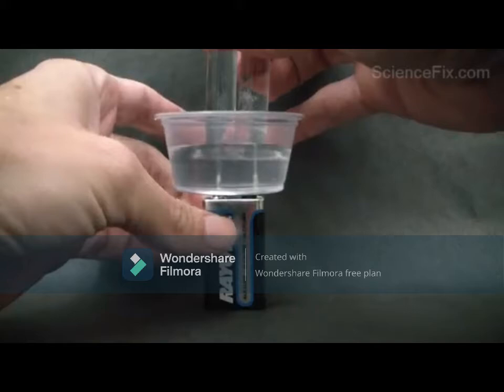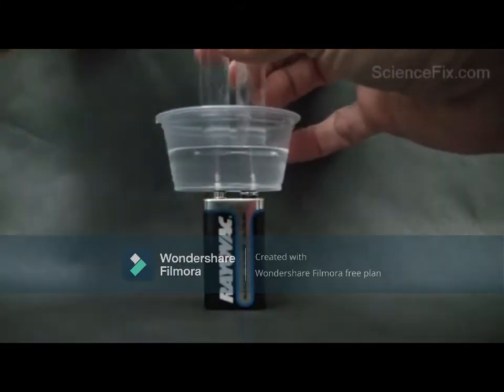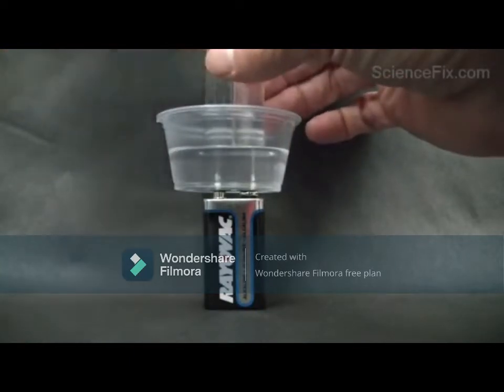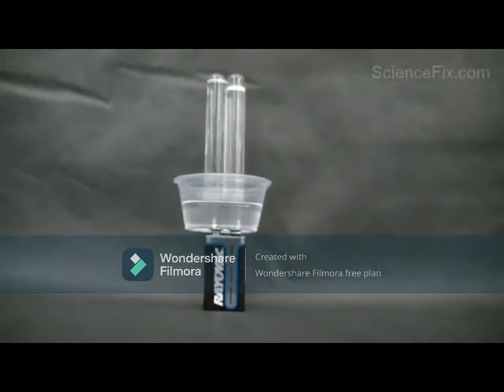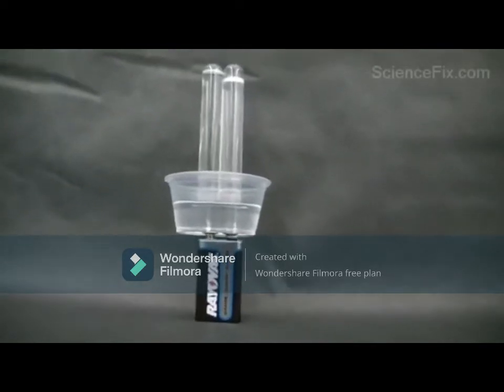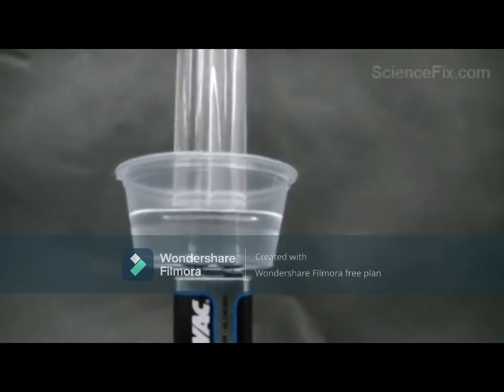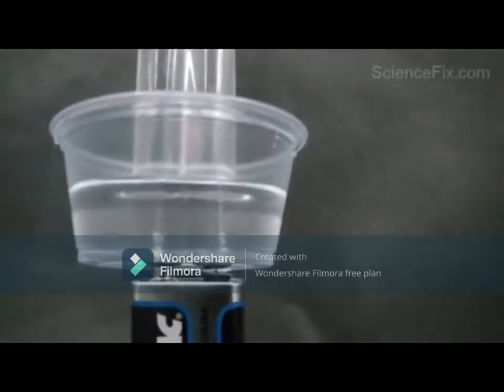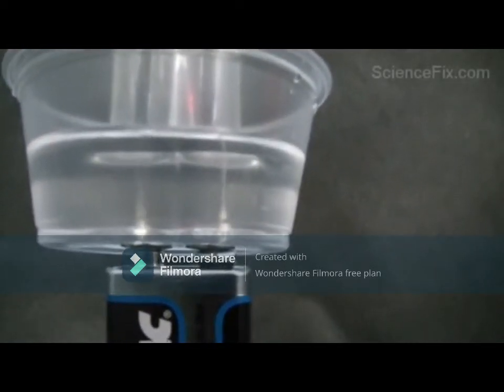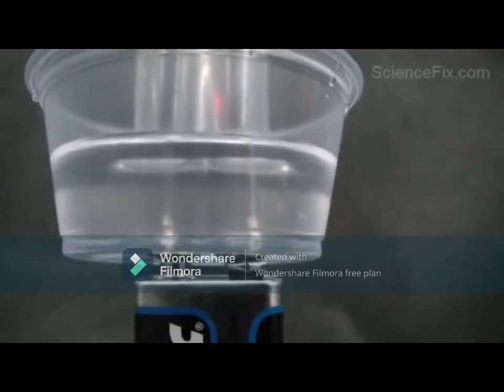You may need to add some acid or bicarbonate solution to increase the electrical conductivity. So as you can observe in the video, there is effervescence in the two test tubes. One is oxygen gas and one is hydrogen gas. The volume of one of the gases is larger than the other.